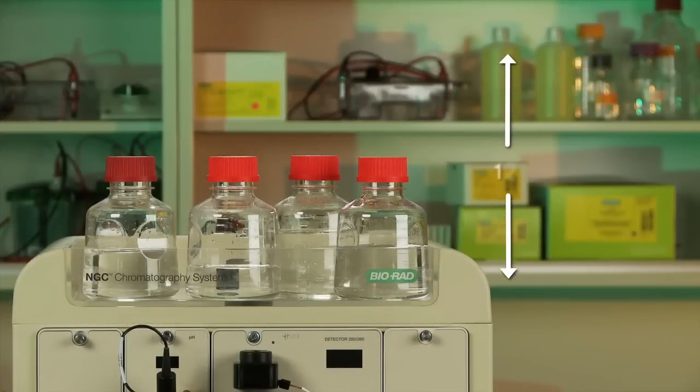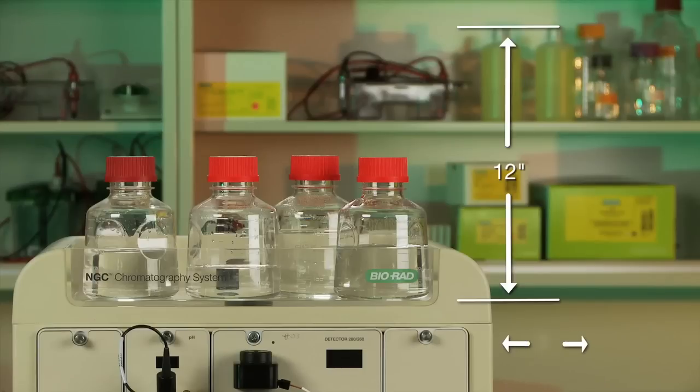We recommend an additional overhead clearance of 12 inches to accommodate bottles in the buffer tray and 3 inches of side and back clearance for wires and any additional components or columns that may attach to the sides of the NGC instrument.